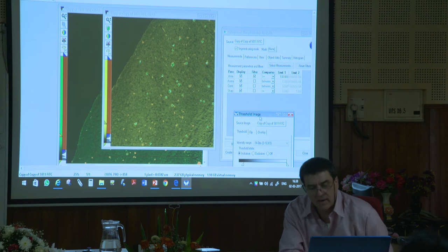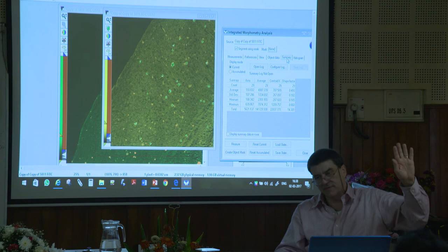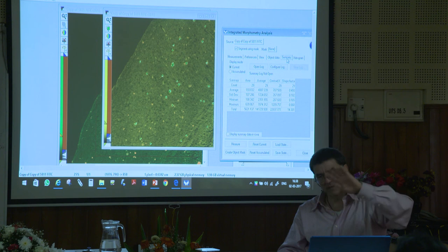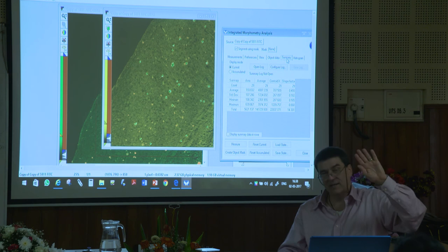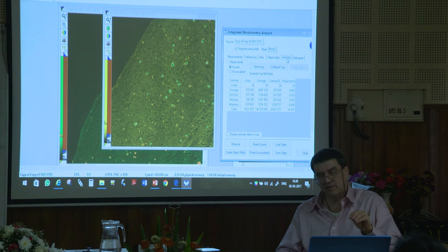Then, when I actually do the analysis and I get the numbers, that's fair. I can compare those and say, you know what? I did this experiment 15 times and I've got a difference that shows that my drug seems to make less plaques. And you take it through statistics. You've got to go find somebody good in math, because every time I did statistics, I had to find somebody good in math to do it. Now my son's a math guy, so I could use him. But then you could publish that. So you see how it works? You can use image analysis as a tool. It's a pretty simple experimental design, but it's pretty powerful.